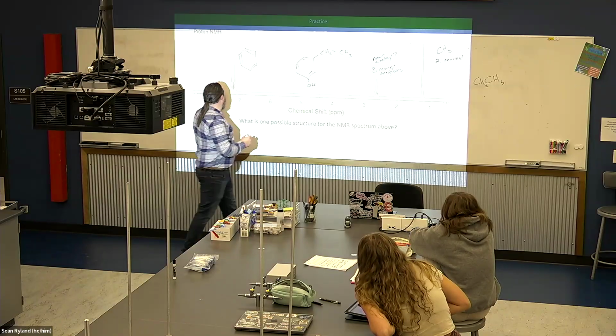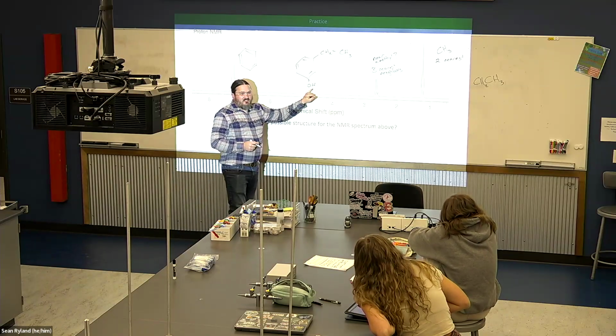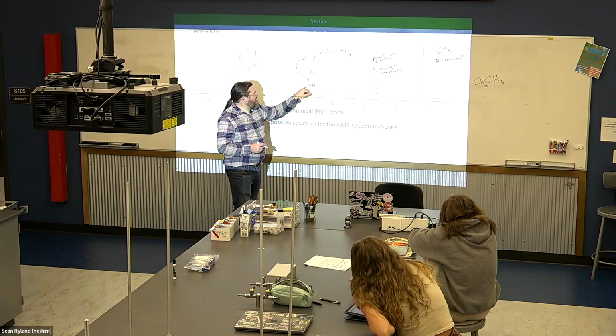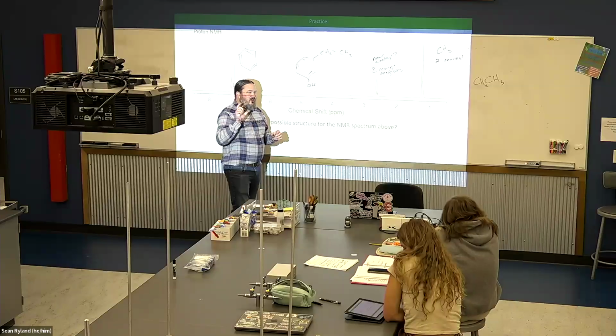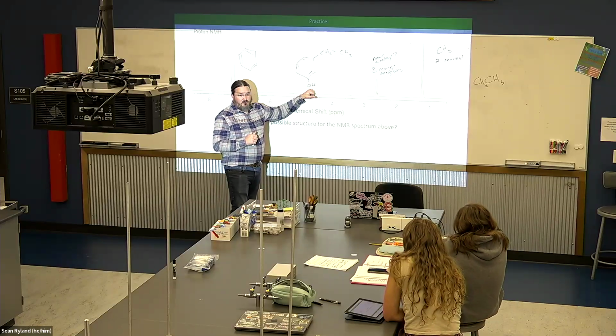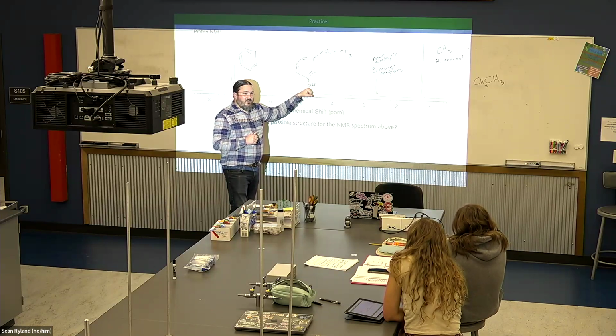The benzene ring gets all clustered anyways. And OHs, these hydrogens don't always show up. Because the oxygen is a different nucleus than carbon, and it causes different interactions. It definitely won't see any splitting on this one. Even if there were nearest neighbors, OHs don't split.